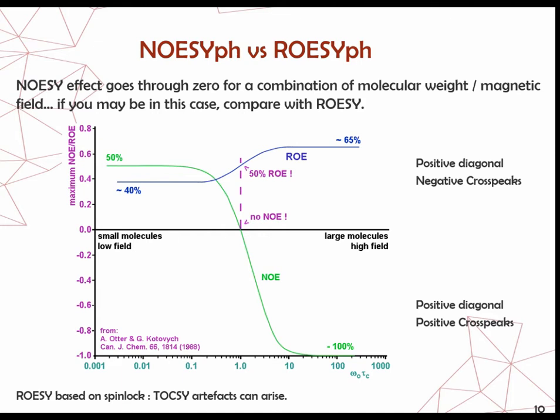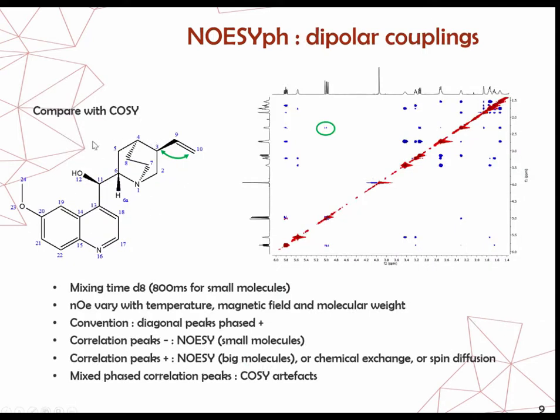For molecules like this one, or maybe 2 or 3 times bigger, 10 milligrams would be okay during the night for all experiments with the standard conditions, with the standard number of scans, and usually you can get a complete analysis within 2 hours with only 10 milligrams. Okay, that's good to know. Thank you.